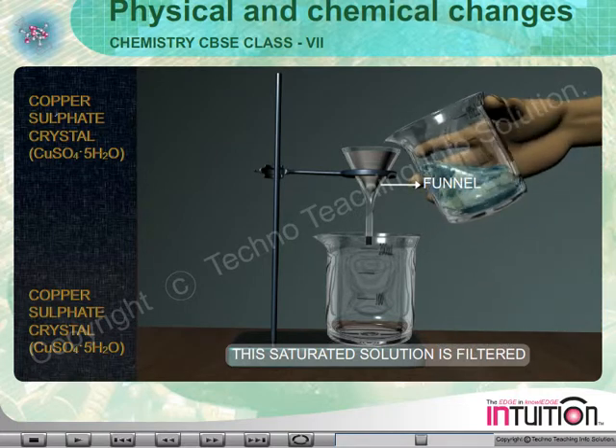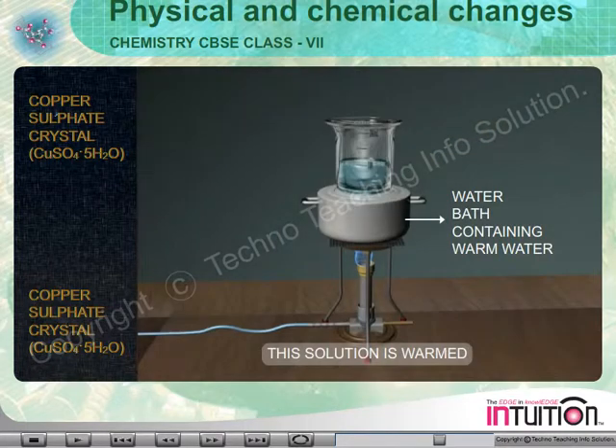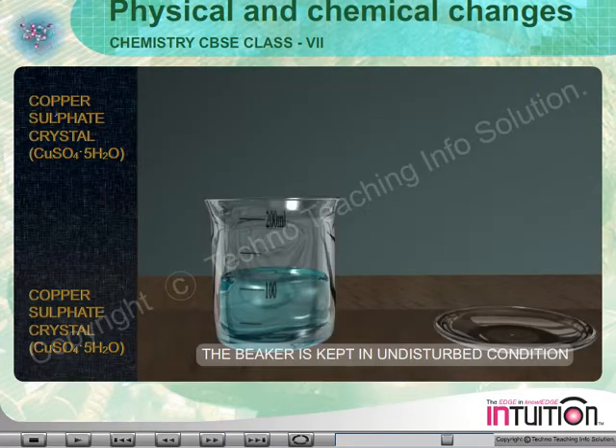This saturated solution is filtered and transferred to another beaker. The solution is then placed in a trough containing warm water and kept undisturbed overnight.